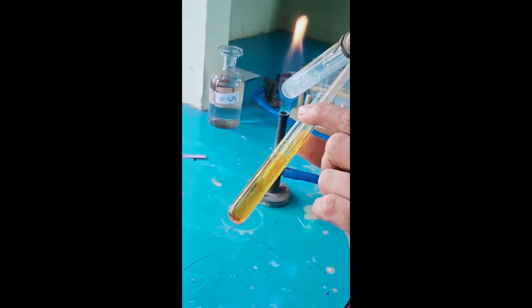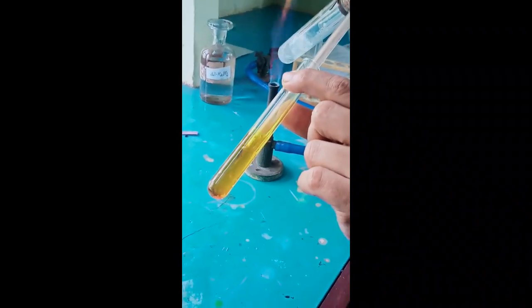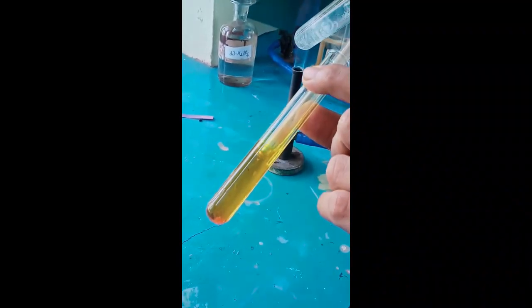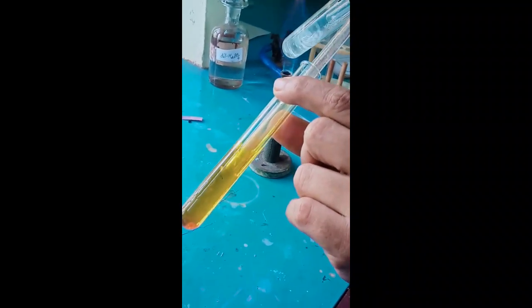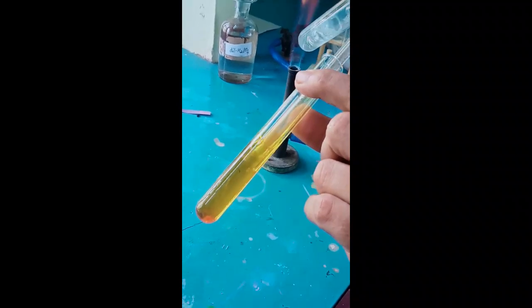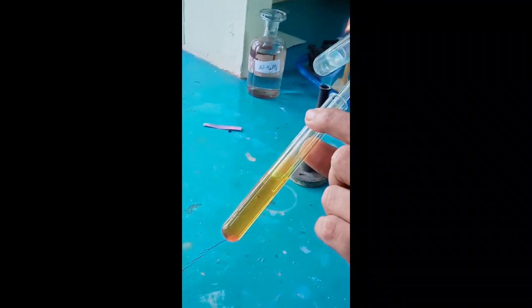Another test for sulfur dioxide is that it turns acidified potassium dichromate from orange to light green. The color of the solution is orange, which changes to green on passing sulfur dioxide. So the test for sulfur dioxide: sulfur dioxide turns acidified potassium dichromate solution from orange to green. The color turns gradually from orange to green as a test for sulfur dioxide gas.